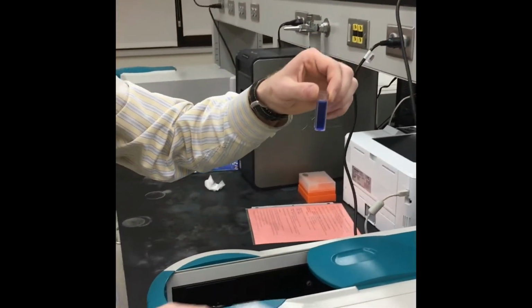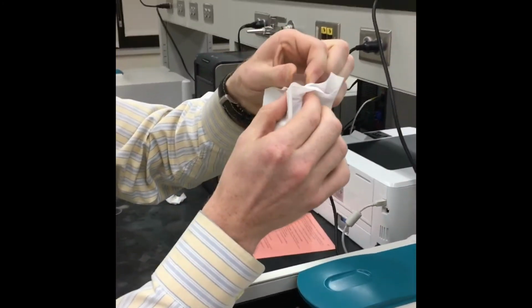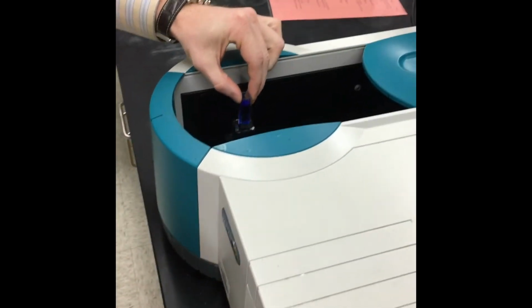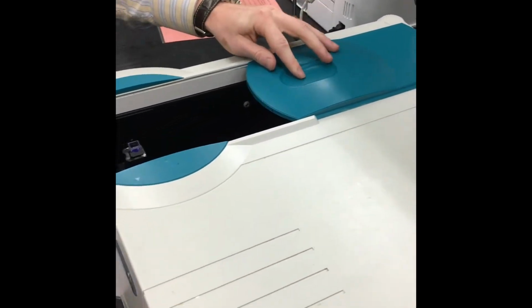So here, Geoffrey is taking our stock solution and wiping the sides clean with a chem wipe. He is then placing it into the spectrophotometer with the clean sides clear in the beam and closing the lid. And then we are running the absorbance test to see what our results will be.